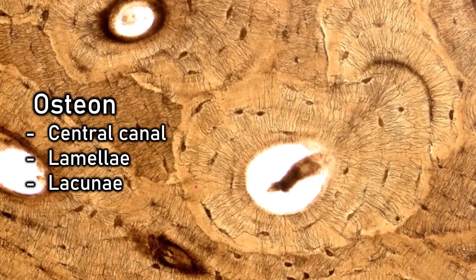Lastly, you see how there are all these black lines radiating out from the central canal? Those are called canaliculi. The canaliculi is how nutrition from the blood supply coming up through the central canal is able to reach the osteocytes living within the lacunae.